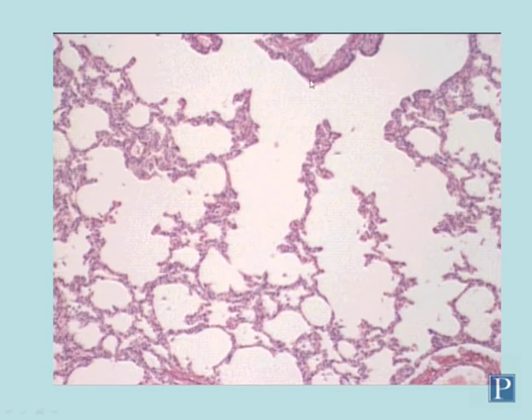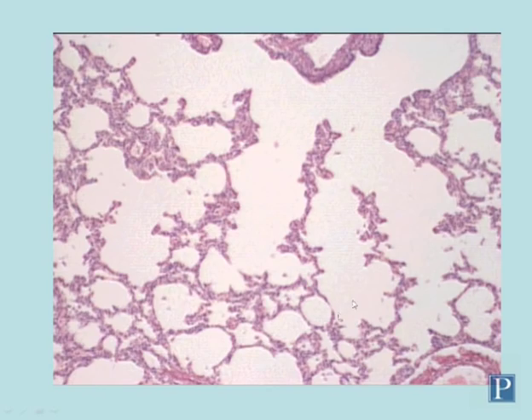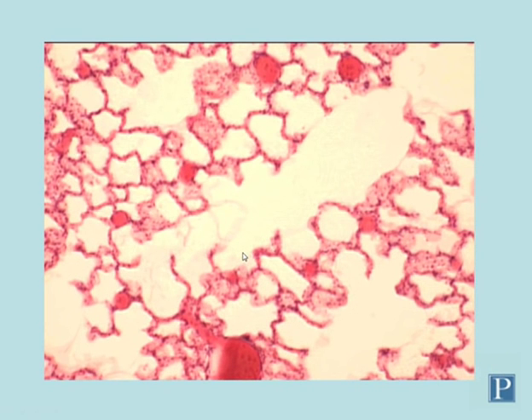Here is a bit of terminal bronchiole with columnar epithelium, branching off into respiratory bronchioles. Here we have some alveolar ducts where the walls are composed mostly of alveoli. You can tell these are alveolar ducts because they terminate in blind alveolar sacs. Here's an alveolar duct terminating into an alveolar sac, another duct terminating into an alveolar sac, and another one here.